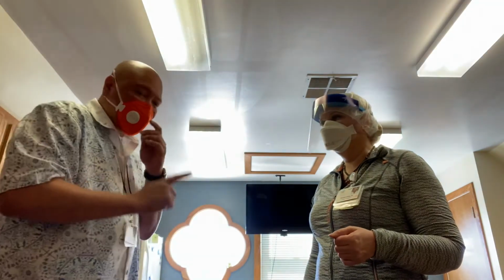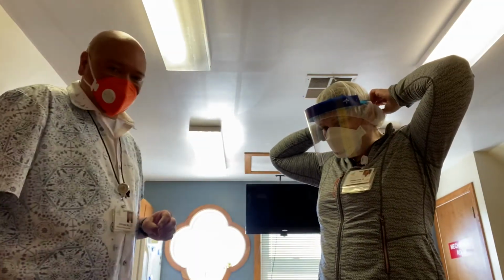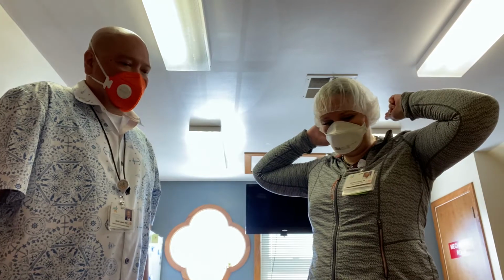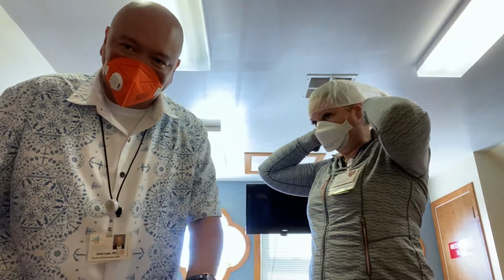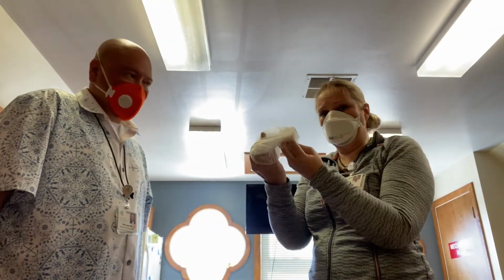Okay? Now the final step is the removal of the face shield and the head cover. Face shield first. Okay? Discard in an appropriate disposal. So basically, all these contaminated items need to be in a red bag, biohazard bag containers, and you're disposing them. Same thing with the hair covering. You roll it inside out, so you don't touch the outside. Correct. Take it off like a sock.